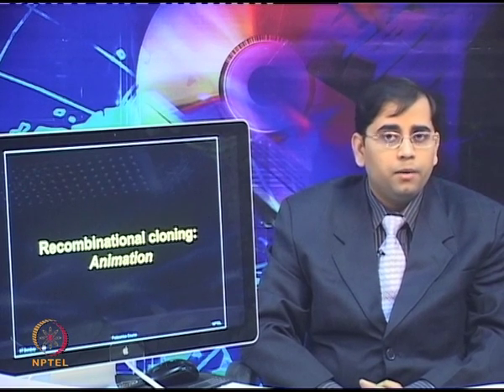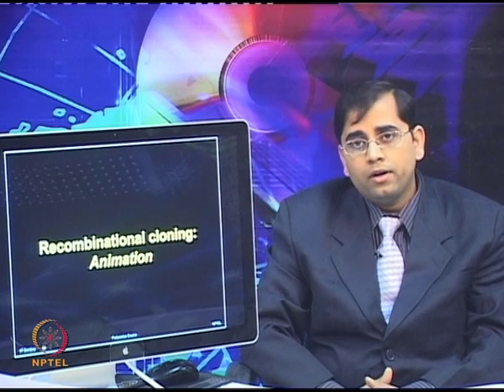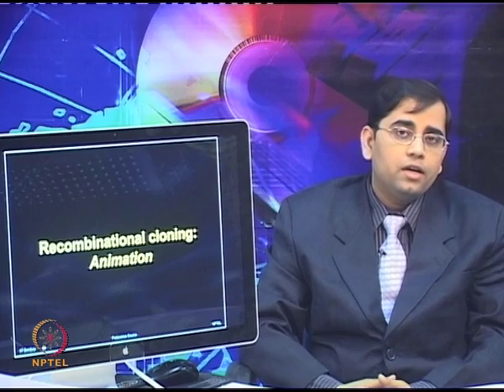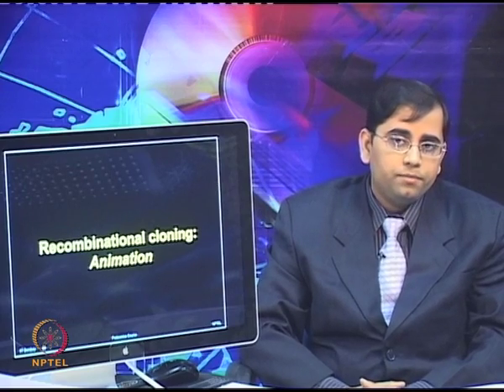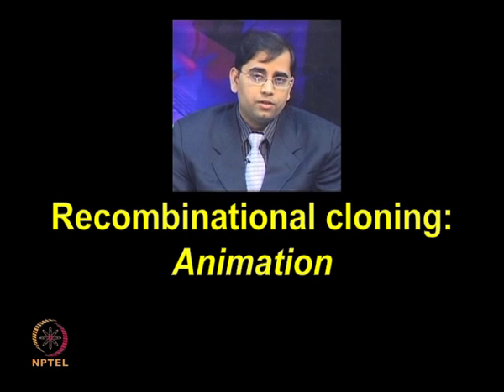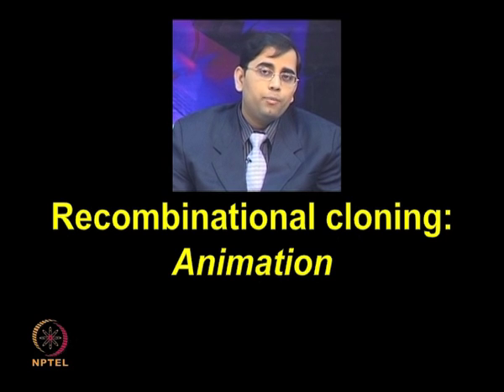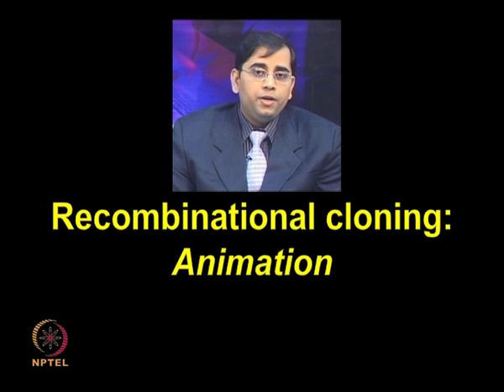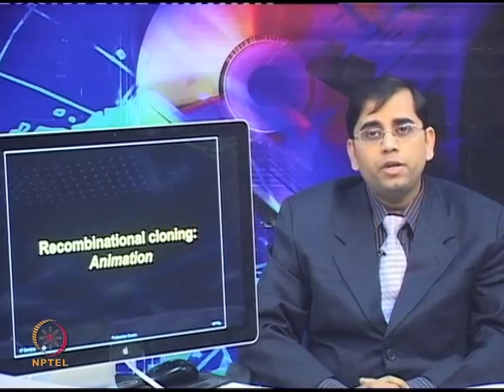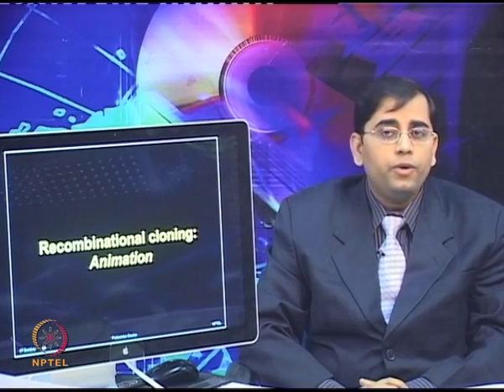As you have seen, the BP reaction can be done in 1 hour, as can the LR reaction, and it allows for high throughput automation. Virtually, these are almost 100% efficient if all the pipetting and reaction mixes are added accurately. So, let me explain the basics of cloning as well as recombinational cloning in the following animation.